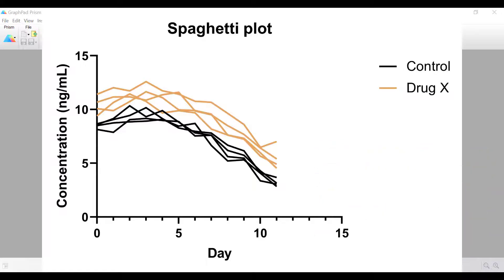The first is where each subject or replicate within the same experimental group is coloured the same. In this example there are two experimental groups, control and drug X, and each group is coloured separately. This is useful to show all of the subject or replicate data for different experimental groups on the same graph.